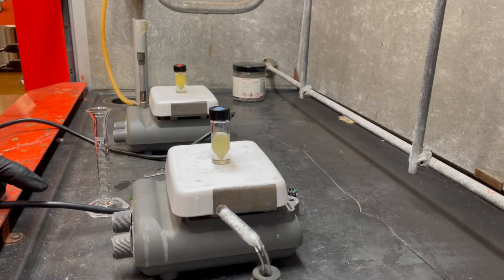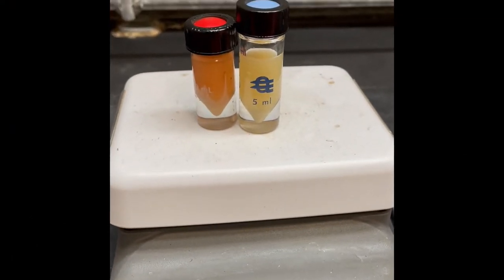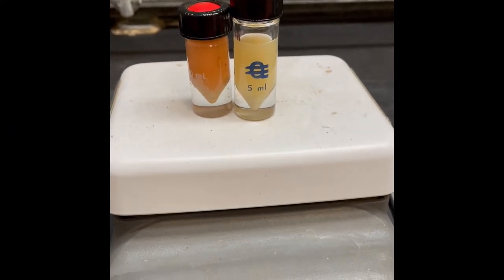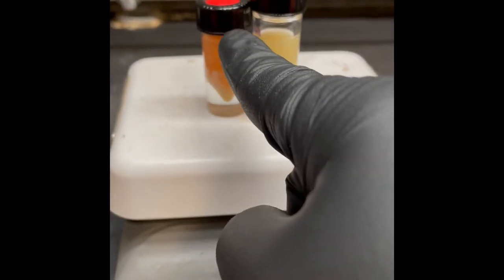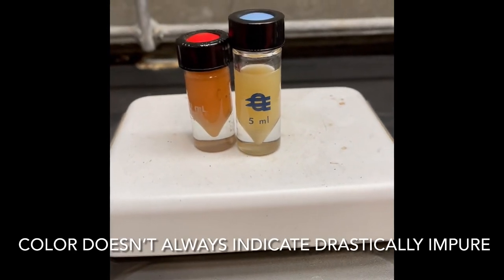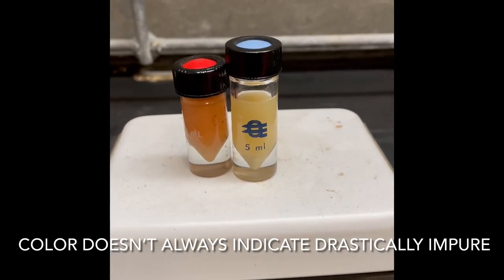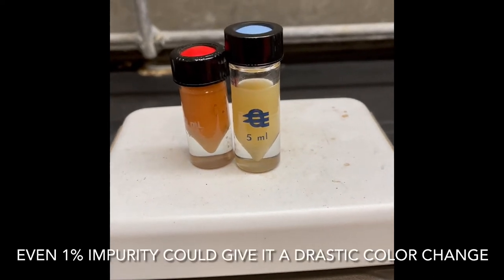But the weigh out is 0.48 grams of that plus 0.75 mils of sodium ethoxide and 2 mils of regular ethanol. Hey, check out that color difference. So this color might be because it kind of touched the red septum, because it's obviously a smaller vial. It's the 3 mils of the 5, but I had to work with what I had.